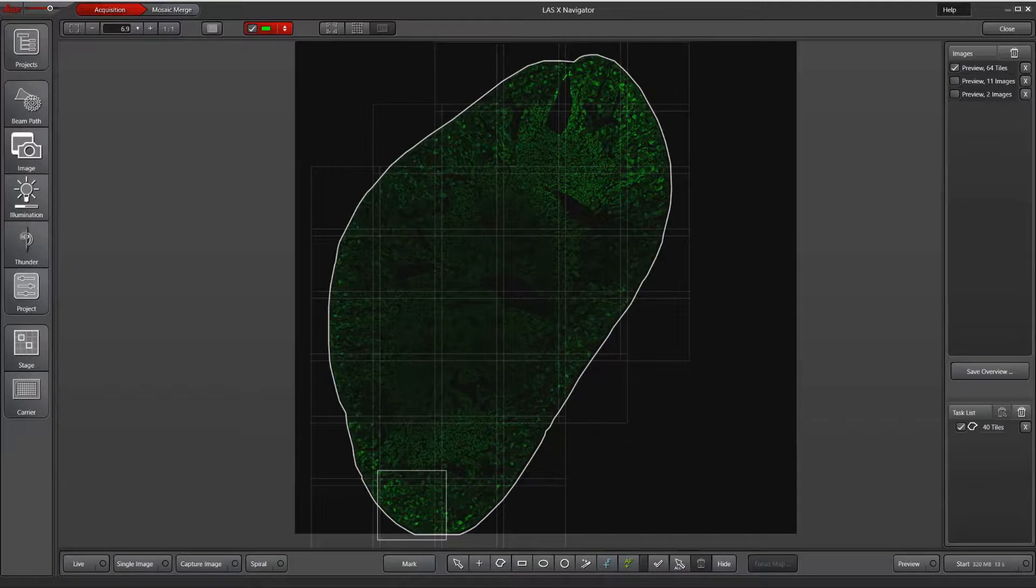What the focus map does is it creates a topographical map of your section and then interpolates the focus between focus map points.